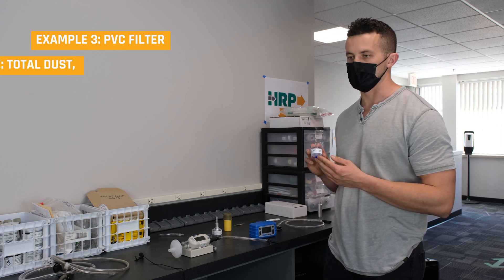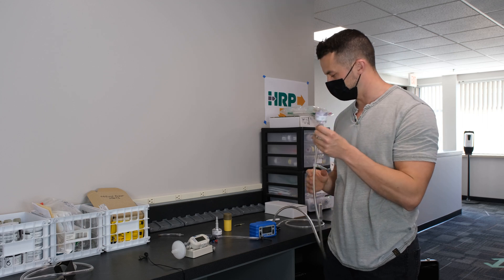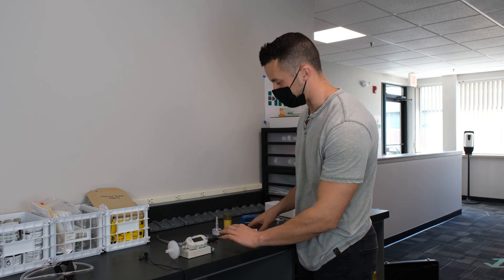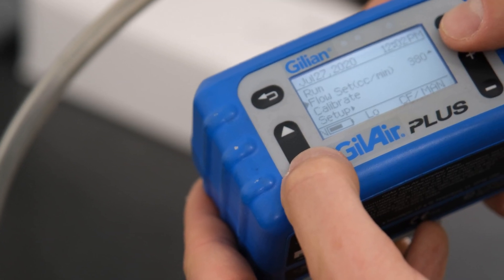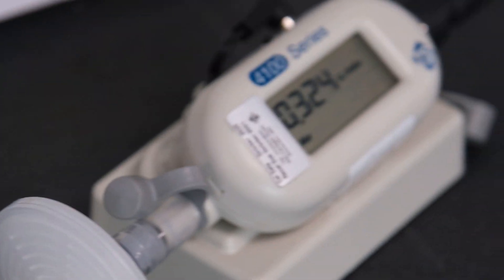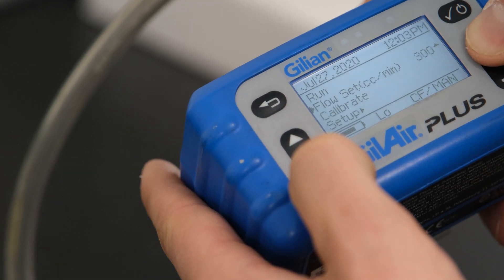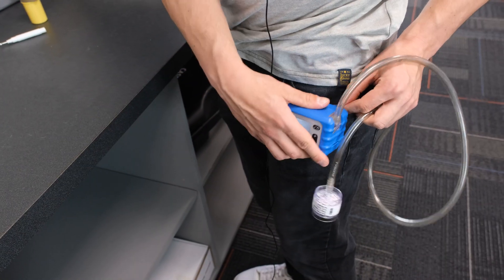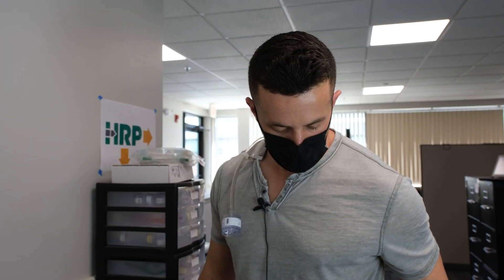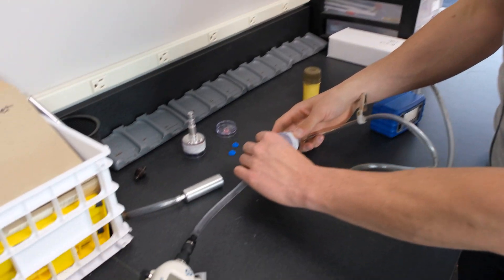Next up we have a PVC filter — this is your basic filter that captures total dust. Get our Tygon tubing with a simple nose head attachment on this one. Plug it in. Now we need to calibrate it, so we're going to use another little nozzle on our calibration, plug it into our TSI 4100 series, and hook it up. We're going to adjust our Gillian GilAir Plus pump to a flow rate we think is appropriate, press run, and look at our TSI 4100 series calibrator for our flow rate. If it's appropriate, we'll record it. Then place it over the employee, connect it in the vicinity of the breathing zone, run the sample, record observations throughout the workday, pause the sample, pull it off the employee, and perform our post-calibration.